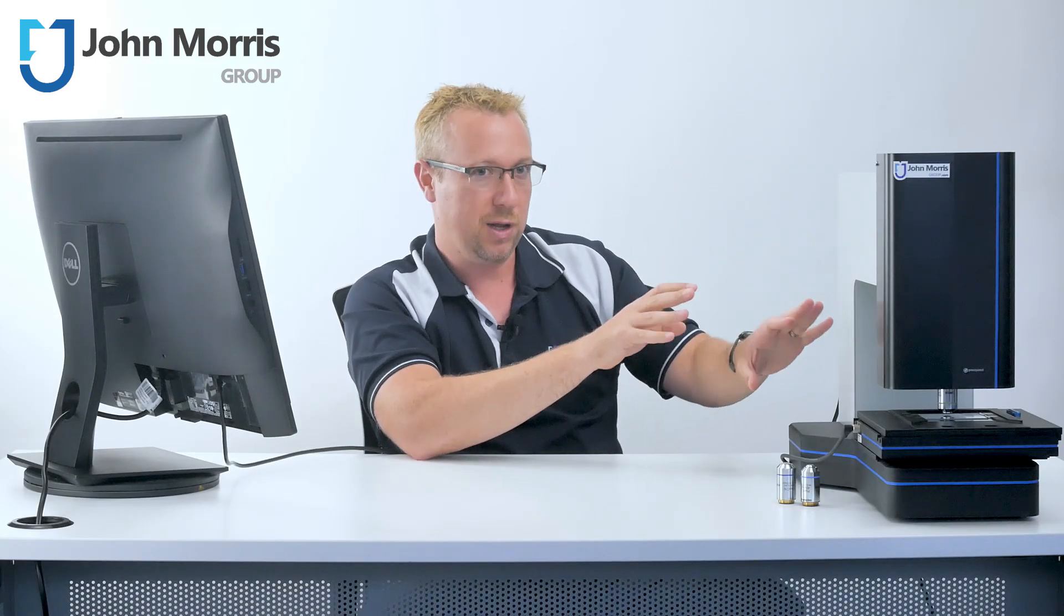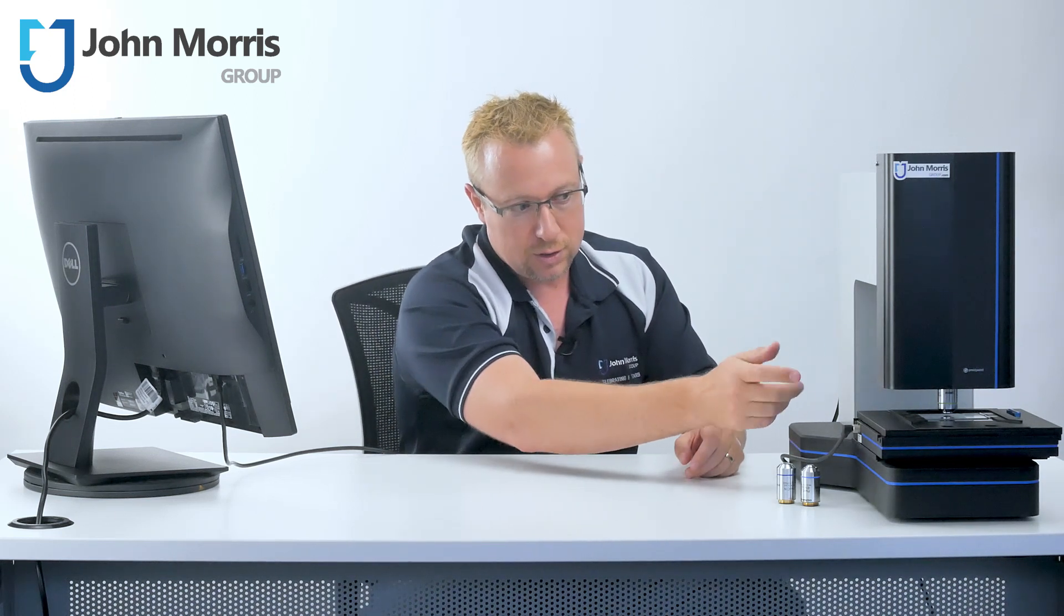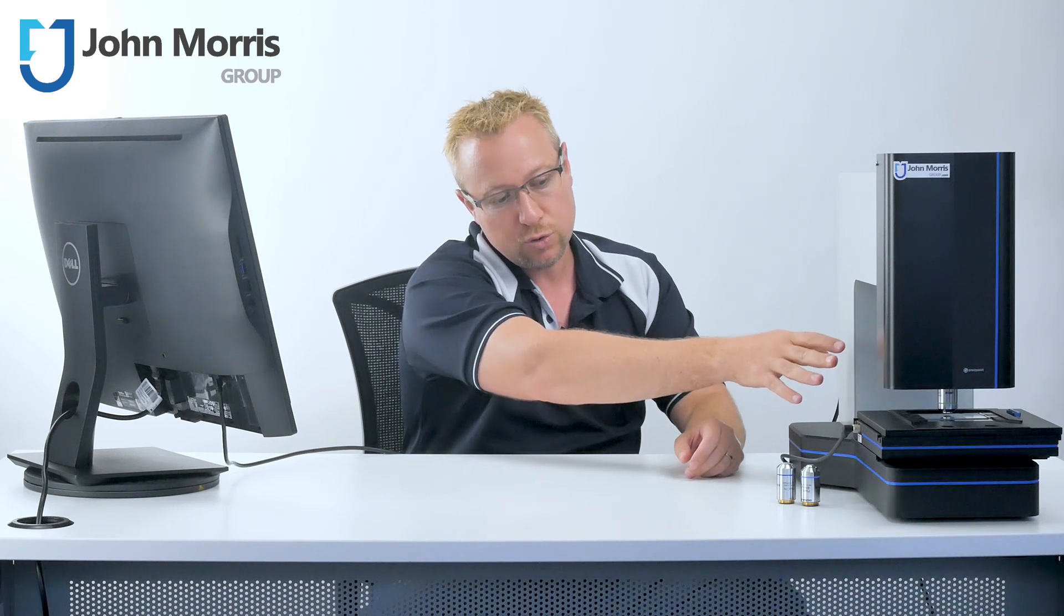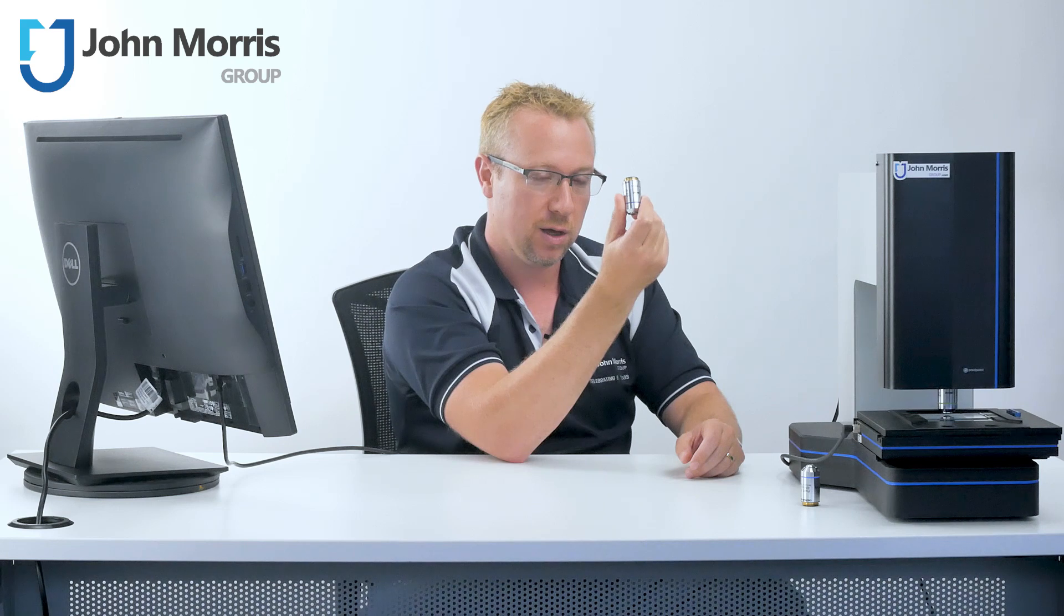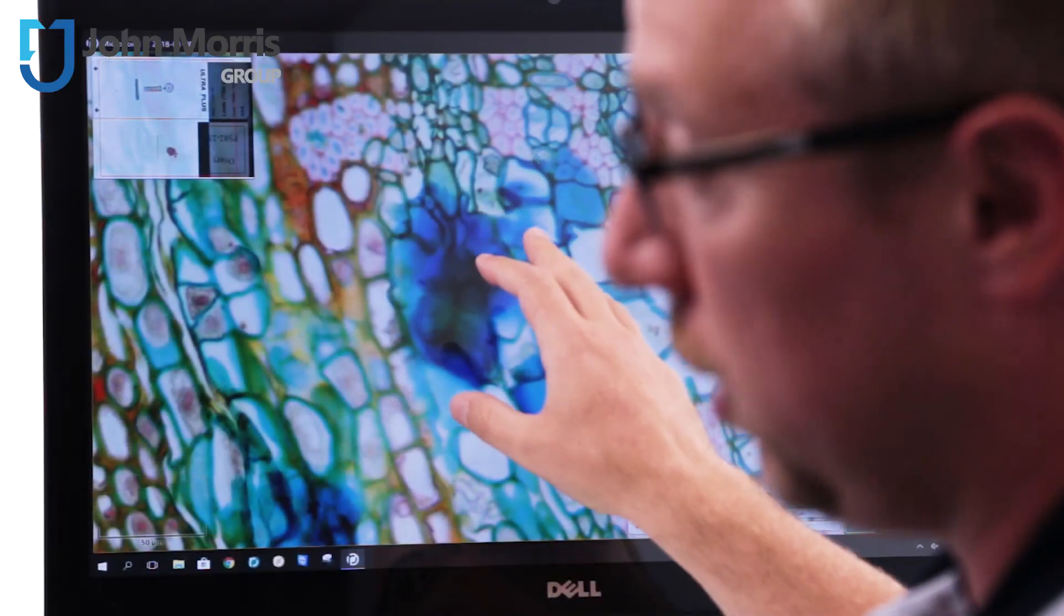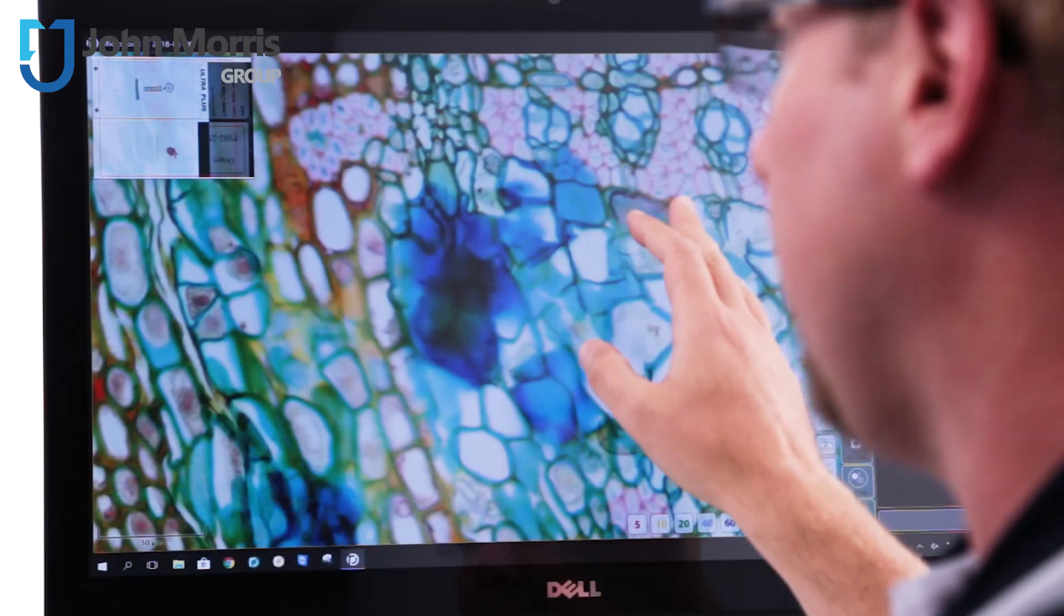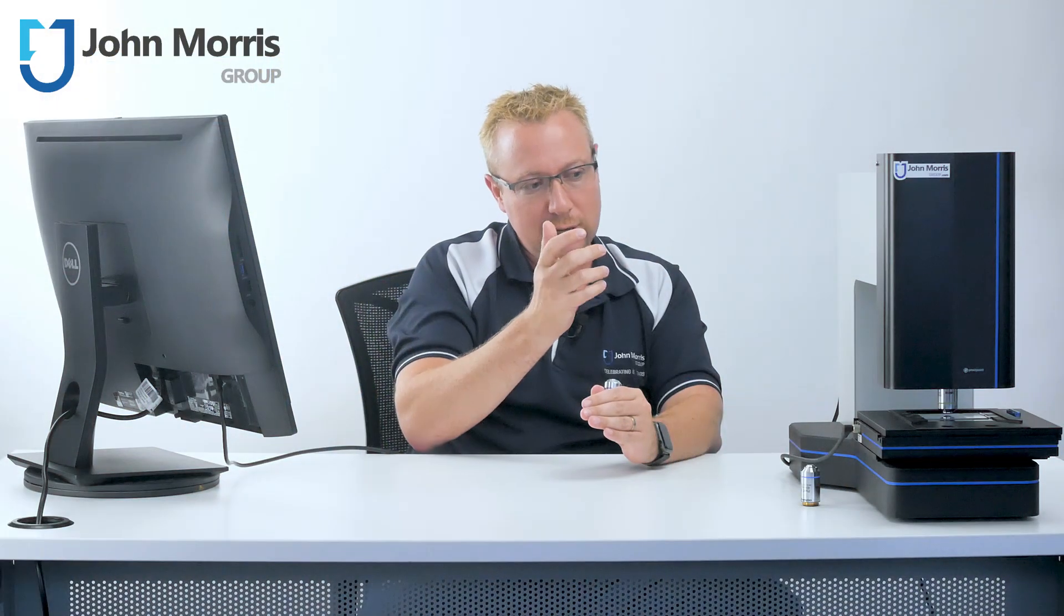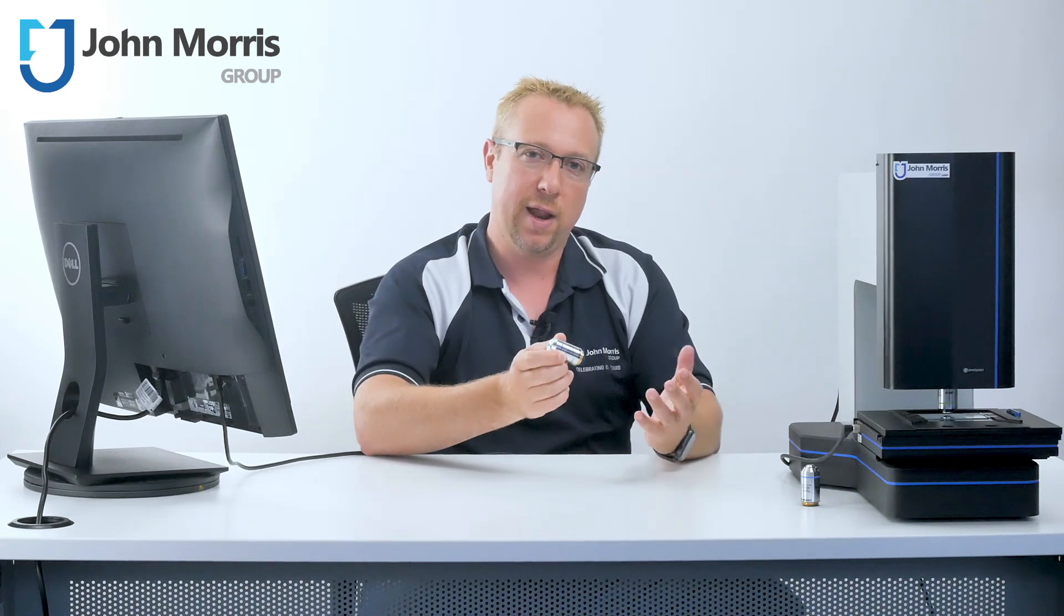So what we've got here is the transmitted light version and rather than a turret that rotates you have three different objectives. You have a 20x zoom all the way up to a 60x zoom which is what we have here and then using the computer you can go anywhere from two times up to the native resolution of your lens or digitally 350x beyond that. Meaning you don't need to rotate to get different lenses or different objectives over it, you can just do everything you need right here from the touch screen. So let's try it out.